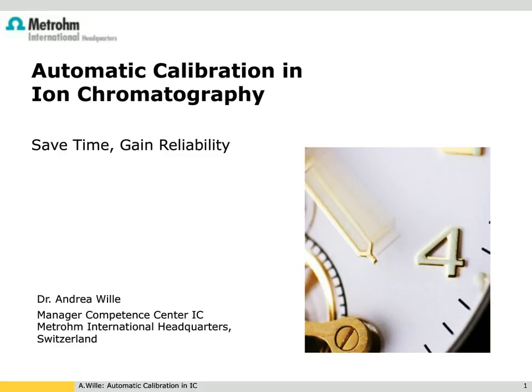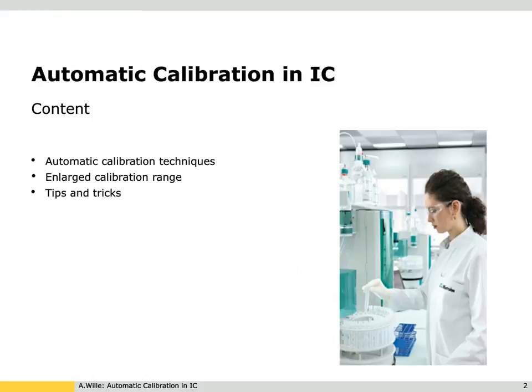The introduction and a very warm welcome also from my side to this presentation, Automatic Calibration in Ion Chromatography. I will show you today different techniques how you can do this automatic calibration, as well as a technique how you can enlarge the calibration range by high-low calibration. The last part of the presentation are tips and tricks for calibration in ion chromatography itself.